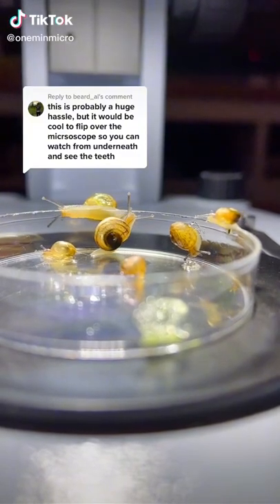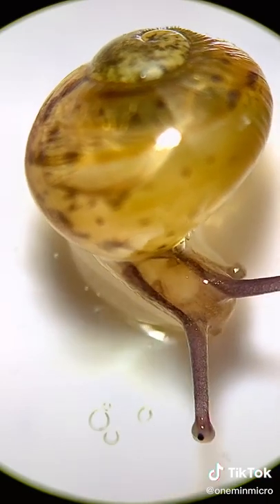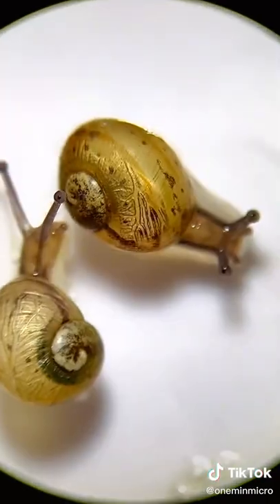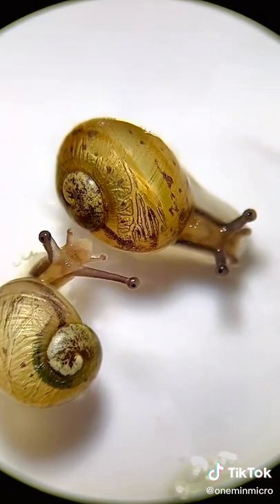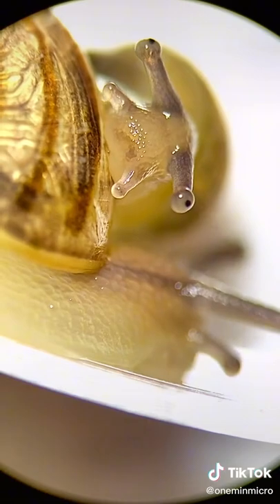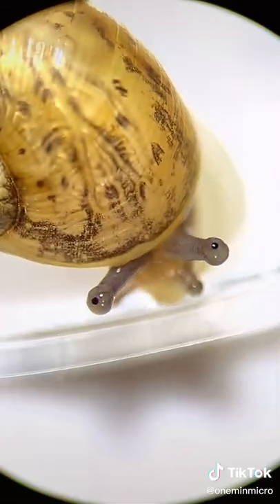Here are some baby snails and we're going to look at them under the microscope. They're pretty cute. I filmed them because I wanted to see if I could see snail teeth. To do this, I put the snails in a glass jar and I flipped it upside down. The snails slimed across and this is what I saw.